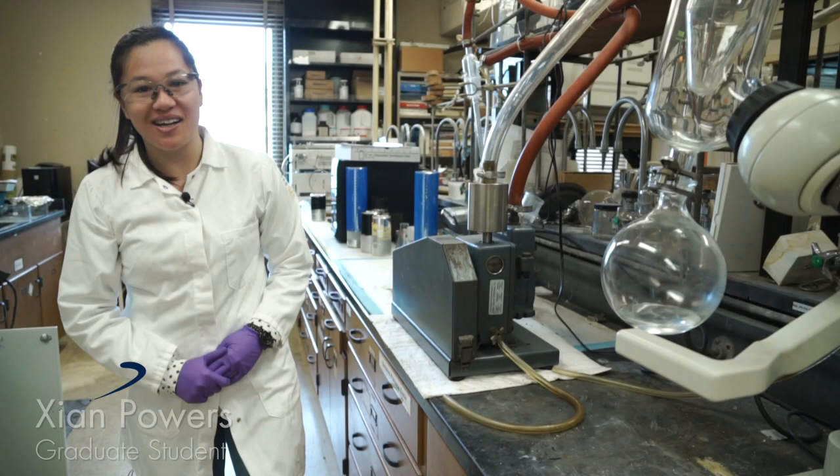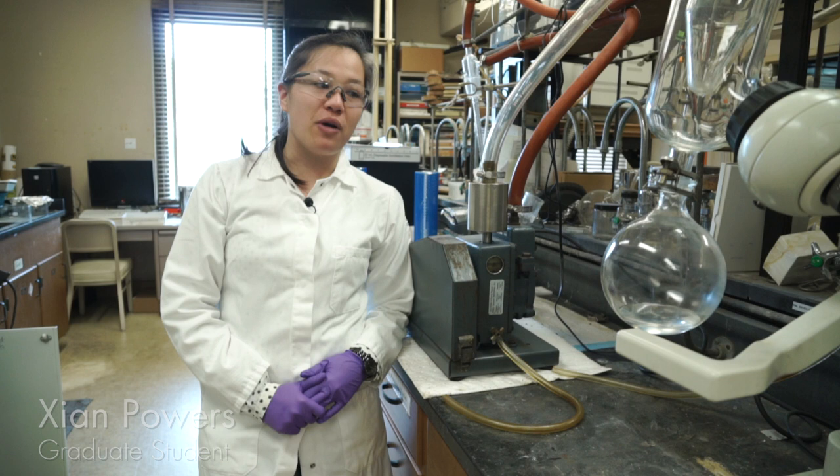Hi, my name is Shian. I am a fourth-year graduate student in the Balch Lab, and today I will be showing you how to change vacuum pump oil.